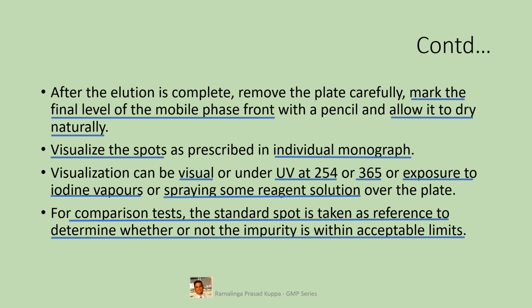Quantitative measurements are possible by means of a densitometer, that means absorbance or fluorescence measurements. HPTLC would suit such analysis very much. I hope the simple technique of TLC is understood well. If all these aspects are taken care of, the TLC results are no less than HPLC or GC results. Look into your TLC test procedure and check whether or not all these features are included. Revise your system to meet these requirements for better results.